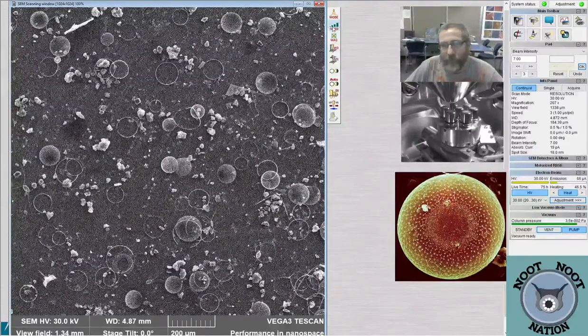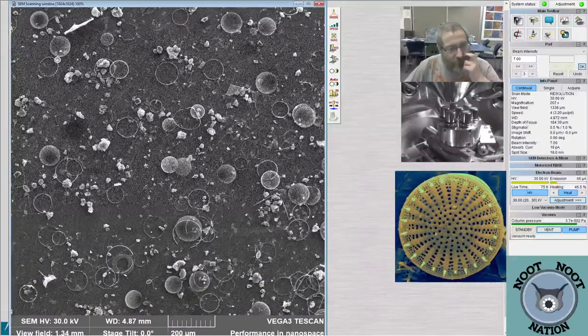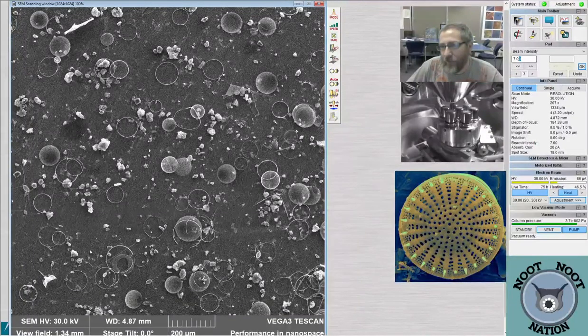Sorry, I need to fix the speed settings a little bit. Or maybe I could just turn up the beam intensity.